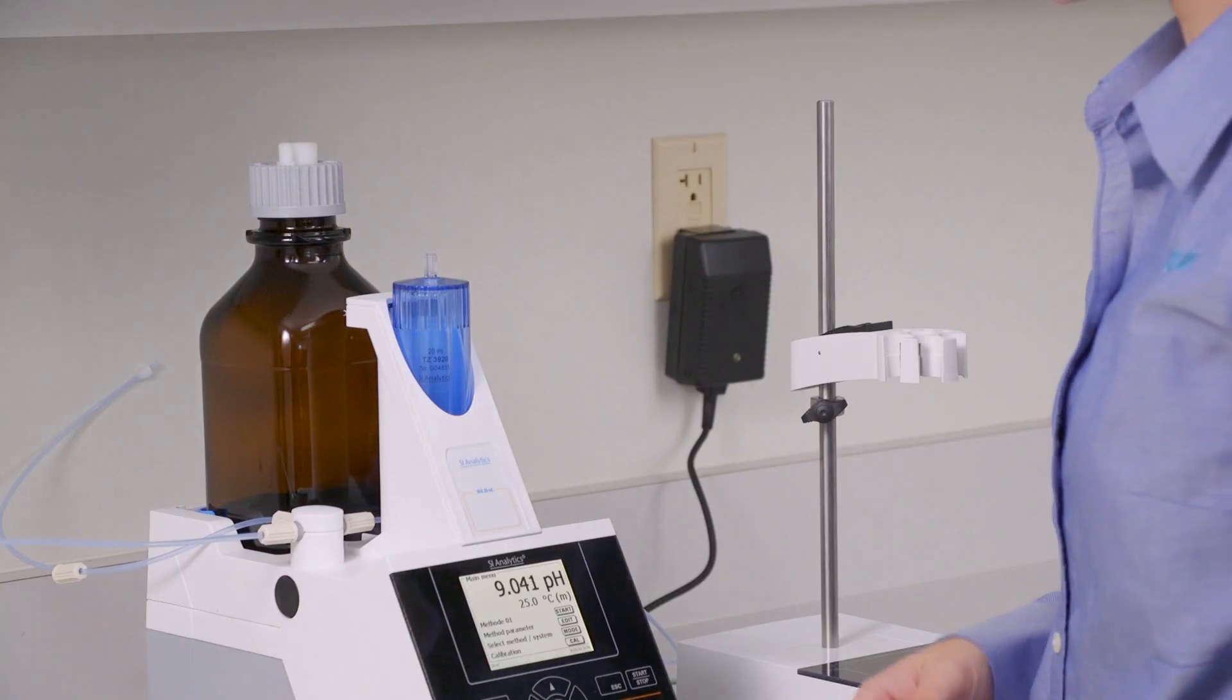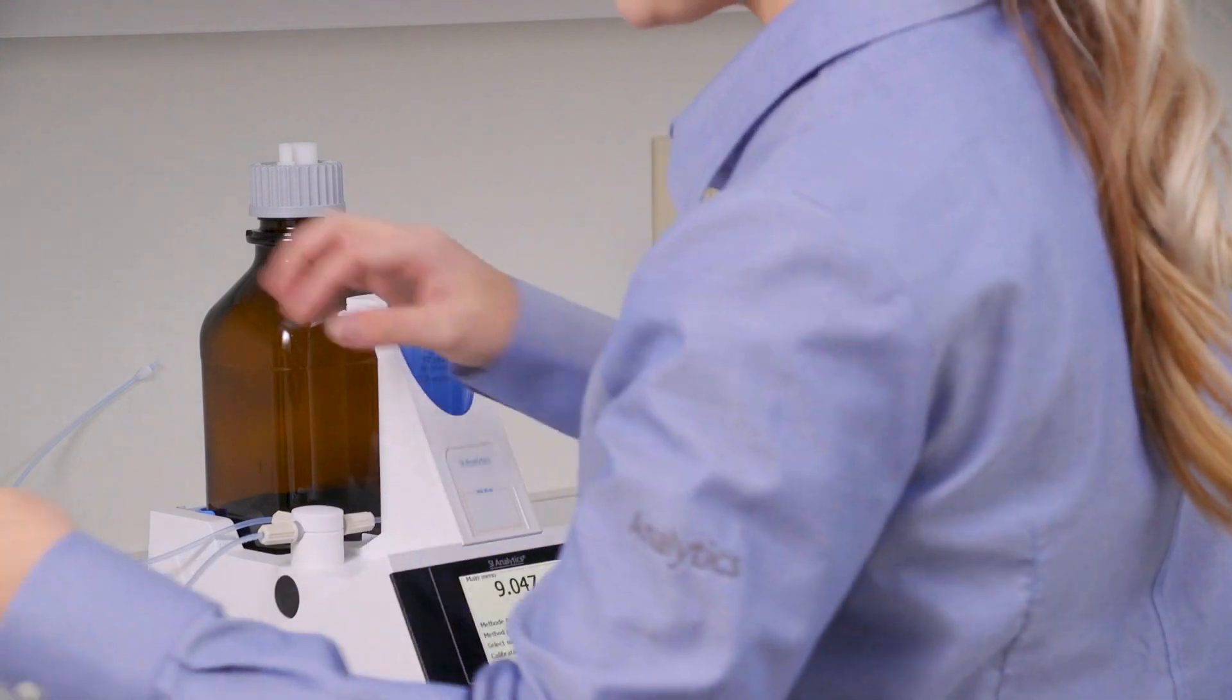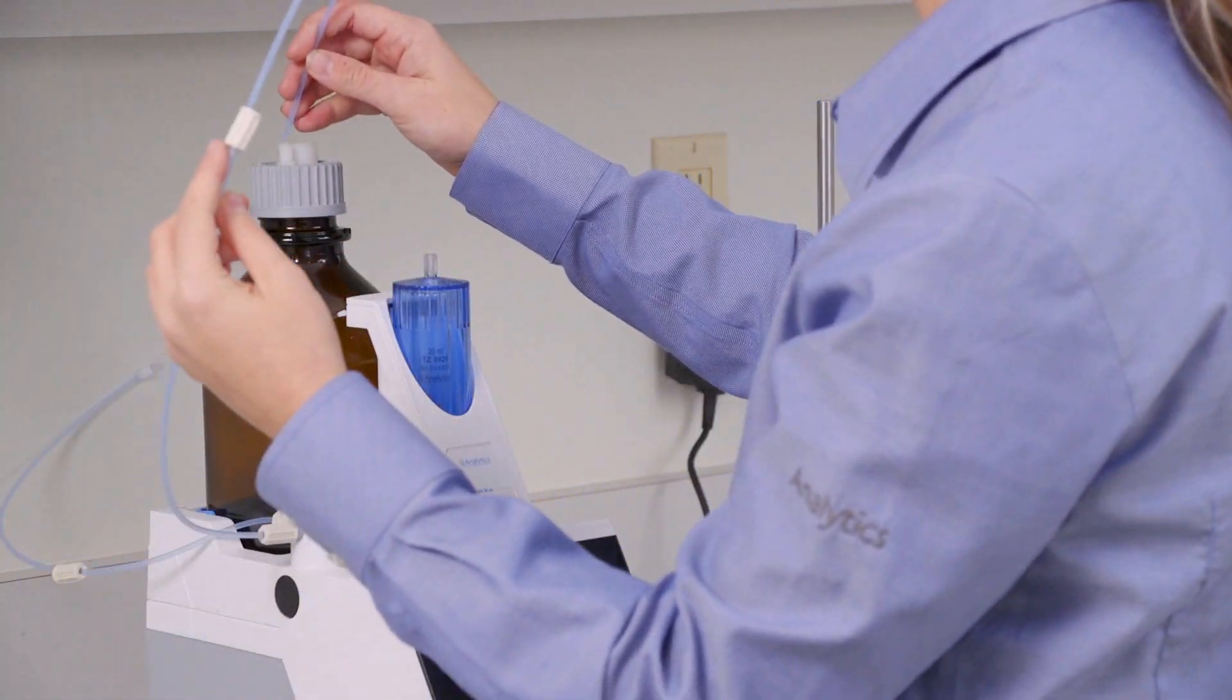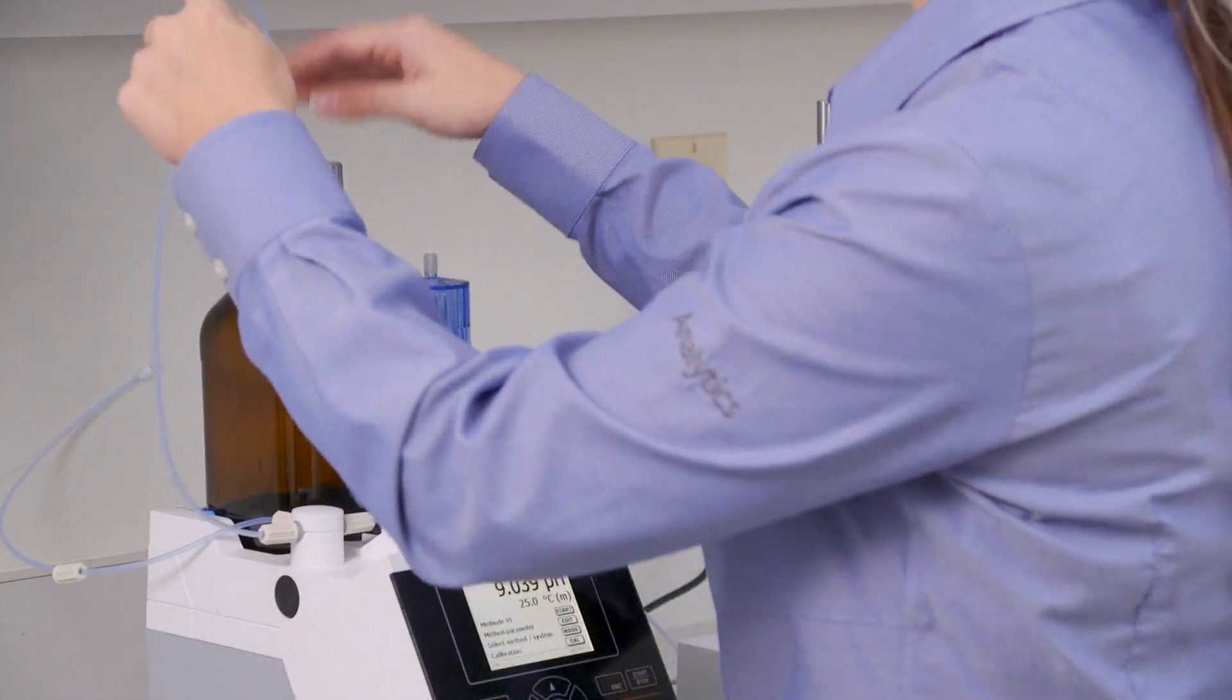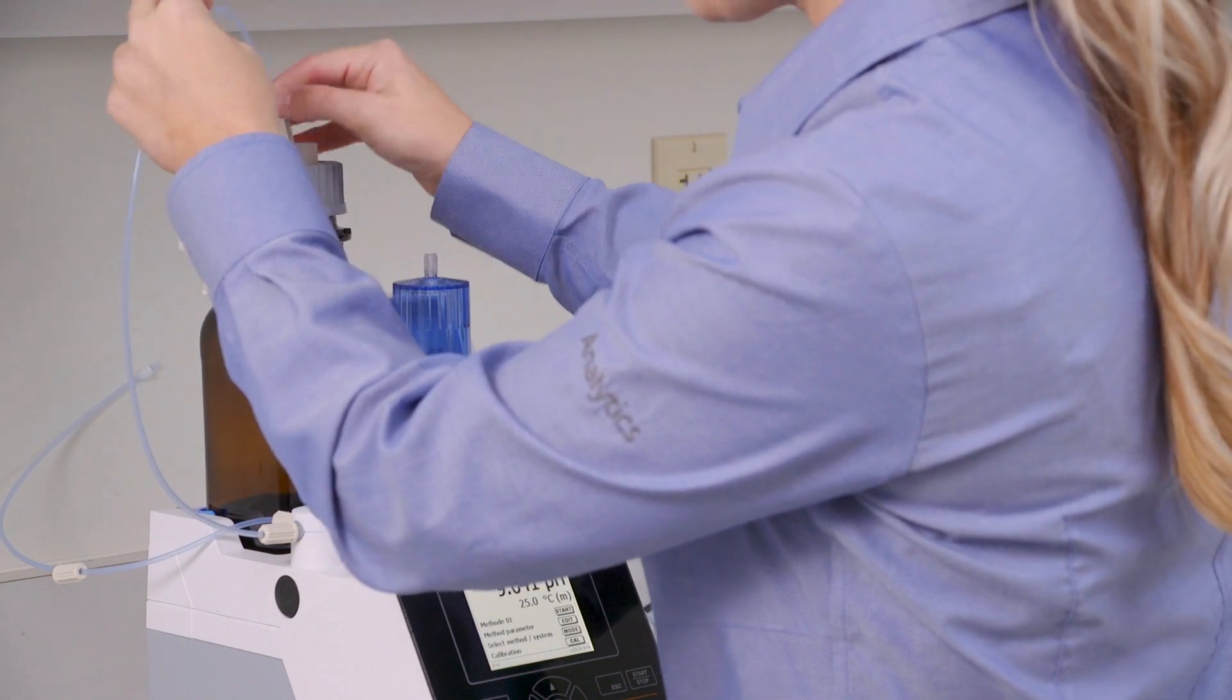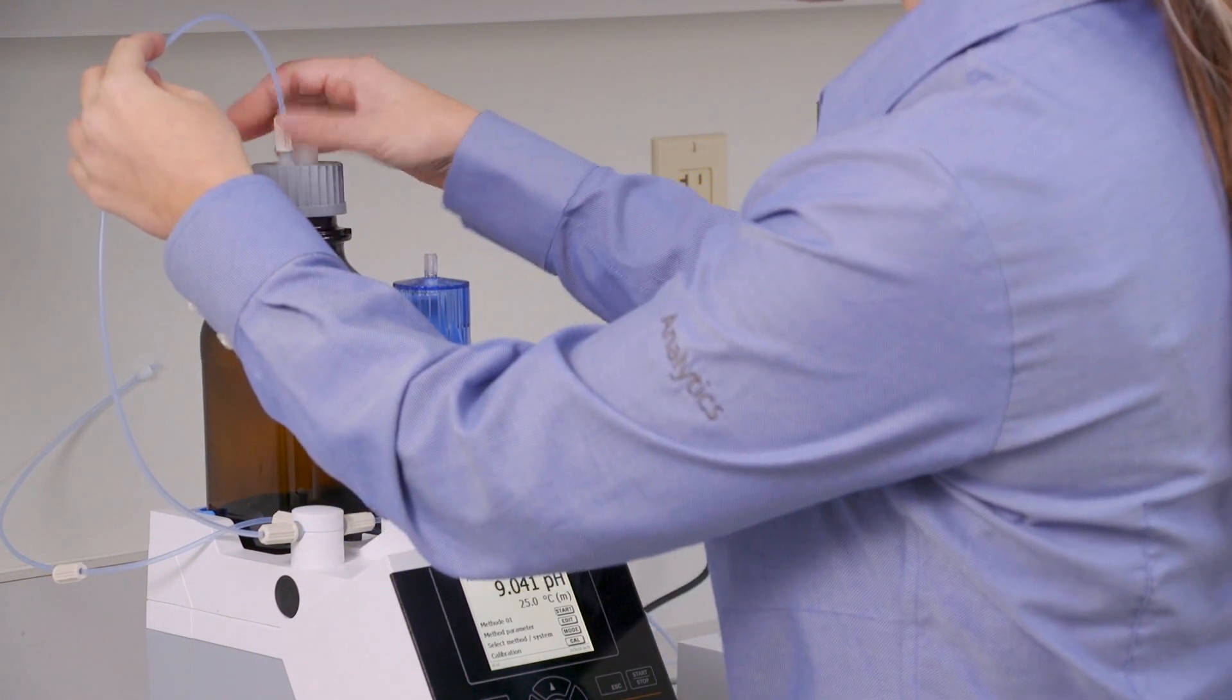Now we can get the rest of the tubing finalized. The tube on the far left side will go into the burette reservoir where the titrant is going to be. So just pull that through the bottle and then screw the thread on top.